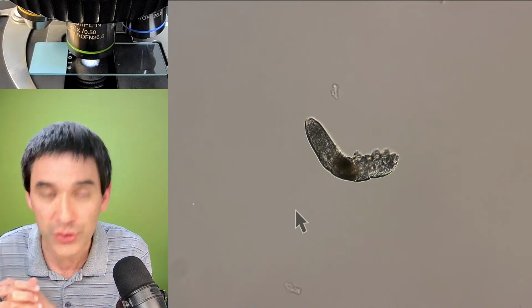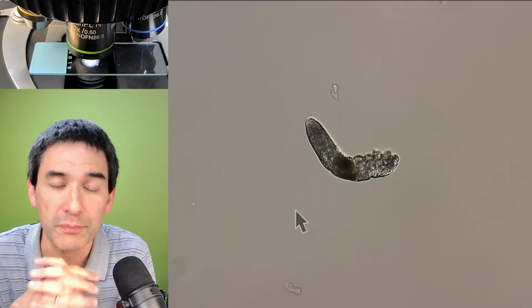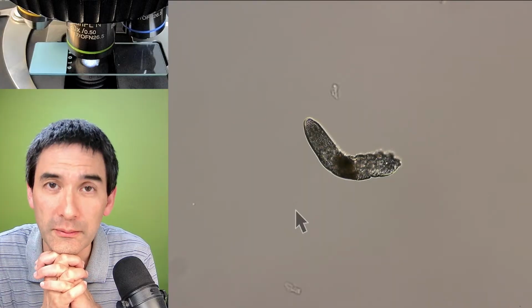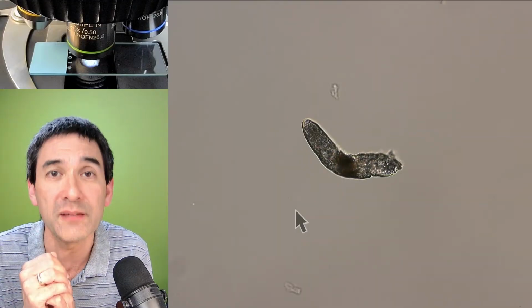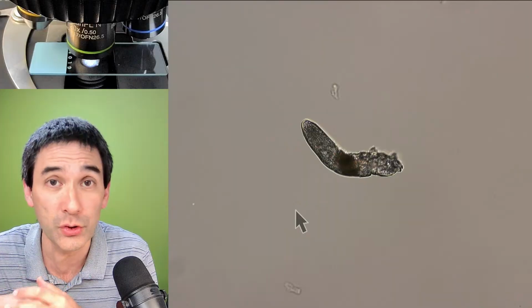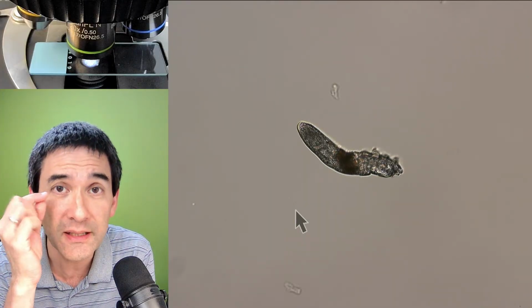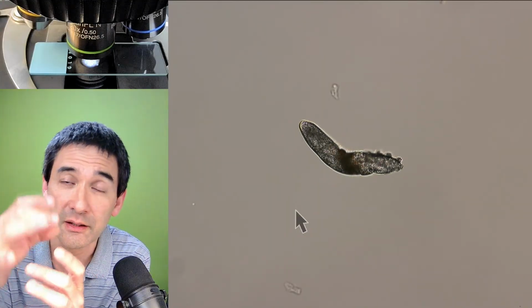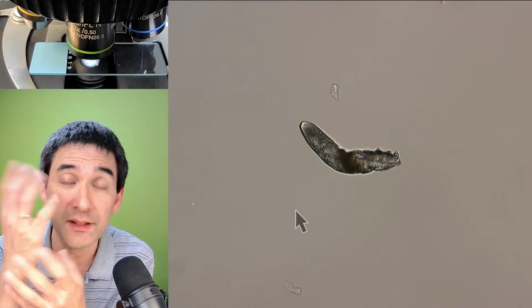And the question is now how do you actually get them and what are they even and so on. So those face mites, if you are young, a child or an adolescent, chances are that you do not have as many of those. The older you are, apparently pretty much everyone's got those, right? And they're living in the hair follicles. The hair follicles are basically the cells that make the hair, right? In this case, the eyelashes, and this is where they live, right?